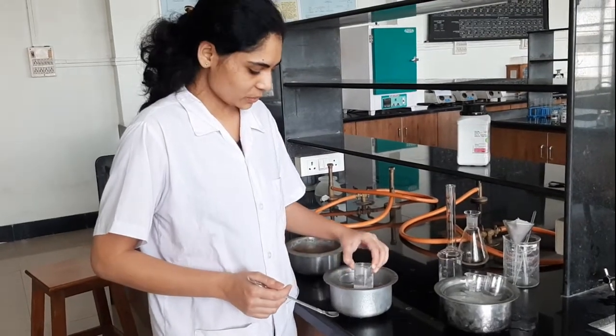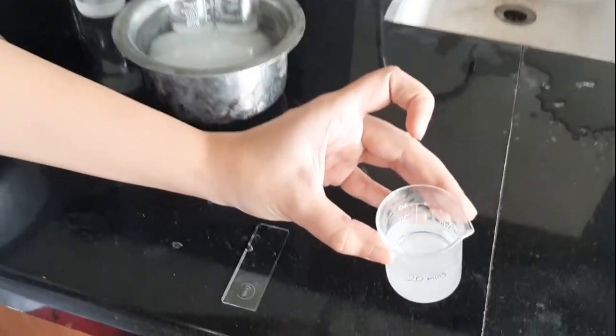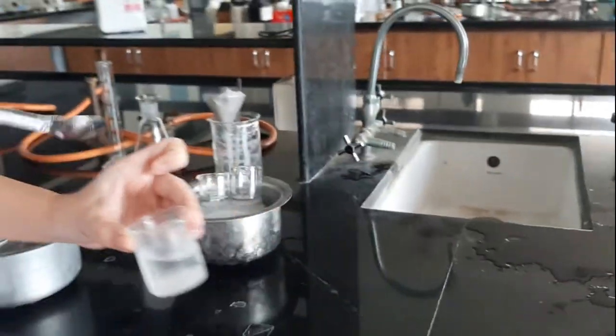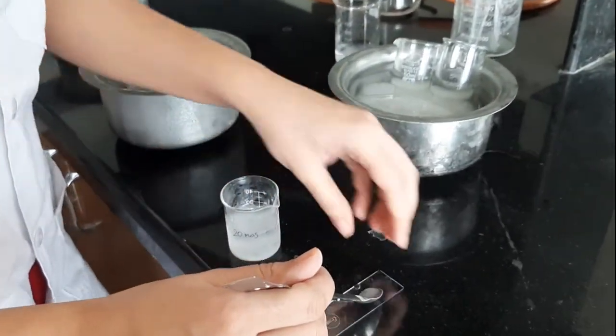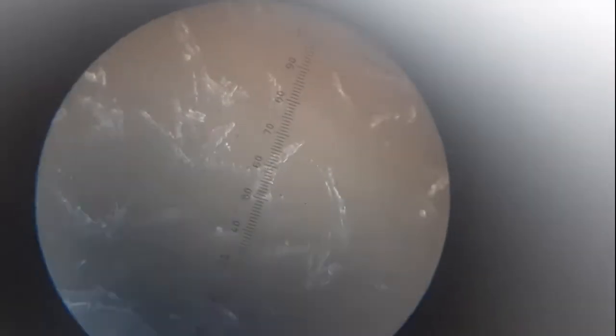Now we will take out the 20 minute sample, and have a look at the crystals. You can see the crystals. Very nice crystals are formed. Again we will take some sample on a slide, cover it with a cover slip, and see the crystal growth.